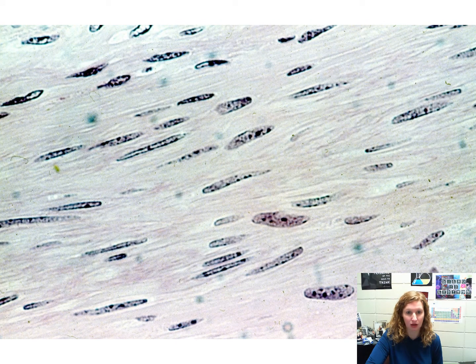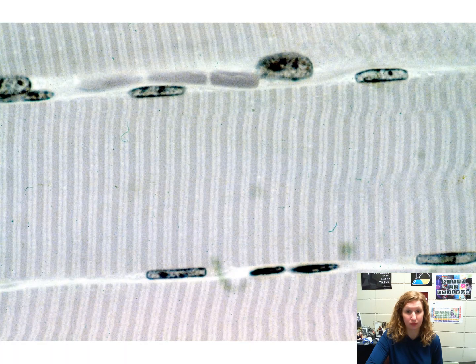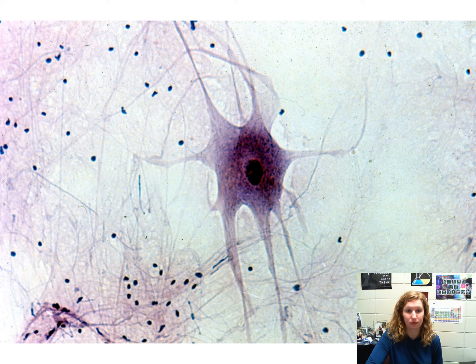Muscle tissue quiz. Cardiac muscle, smooth muscle, skeletal muscle, cardiac muscle, skeletal muscle, smooth muscle, skeletal muscle.